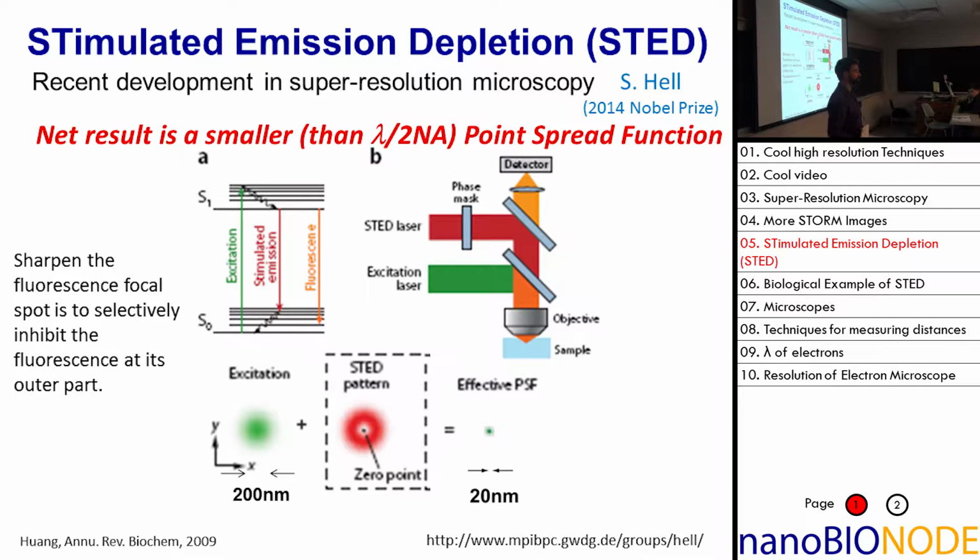In fact, it's so powerful that at first you think there's no way you can do it. In fact, you can do it with only certain fluorophores, because when you hit it, you have to make sure that you don't hit it and vaporize everything. And in fact, that is the main criticism of this technique.